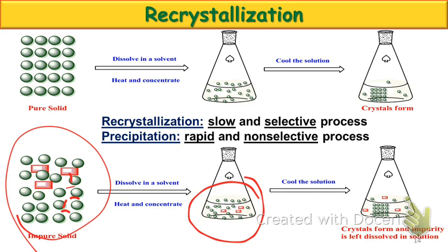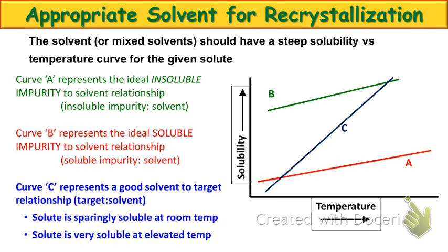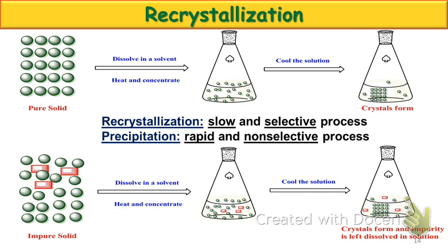Okay. What would happen if we take that gas state and we cool it? What does the gas become when I cool it? A liquid. What happens when I cool that liquid? Becomes a solid. Okay? So one of our observables when we're dealing with solubility is it tends to correlate very closely with phase transitions as well. So when we cool our solution, we hope to see our crystals slowly recrystallize out, which is what that middle part is referring to.